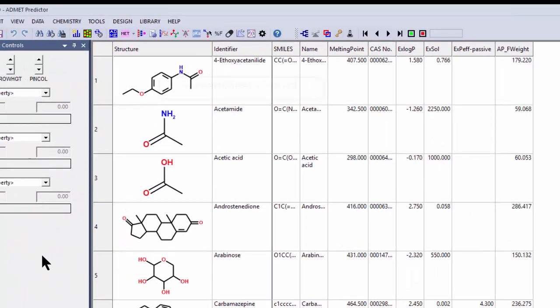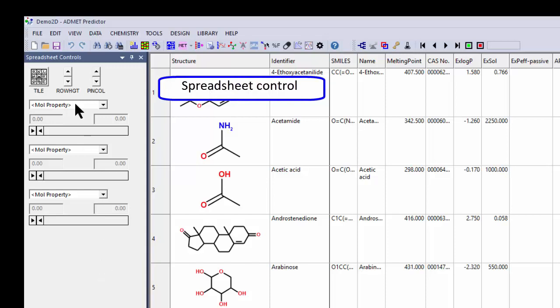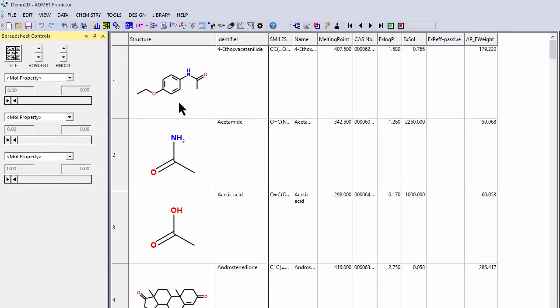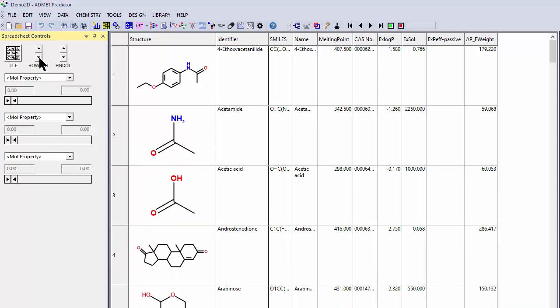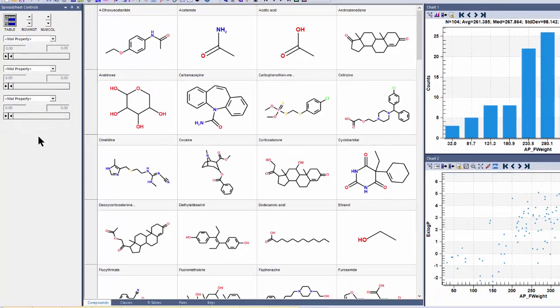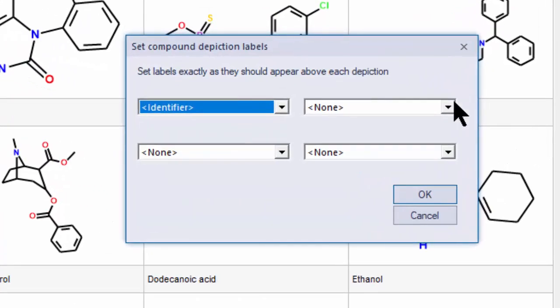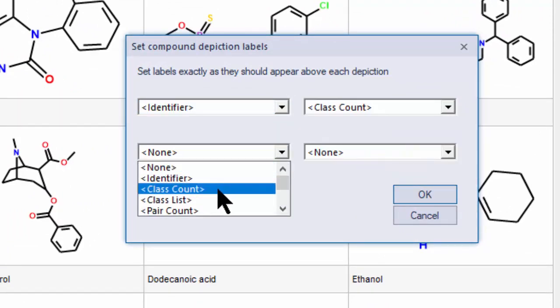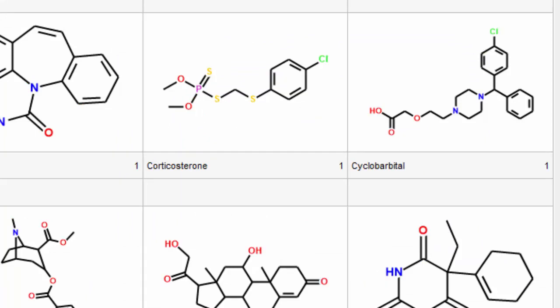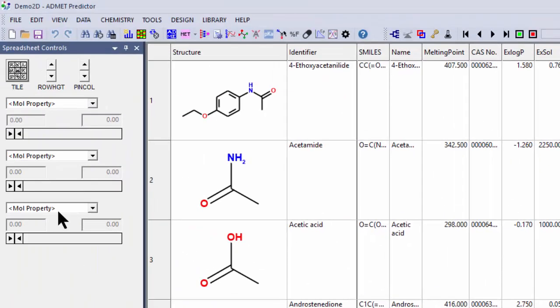Over on the left side of the graphical user interface are the spreadsheet controls. Here I can control the height of each one of the rows, which for larger molecules allows you to see more detail within the molecule. Pin Columns is this black line here — anything pinned to the left of here will stay in its position no matter what tab we're in. Then we have a tile view. If we click on the tile view, it will make these into a grid. We can double-click on any one of the headers and define up to four other measurements or fields we'd like to see on top of each molecule. I'm going to go back to the table view.